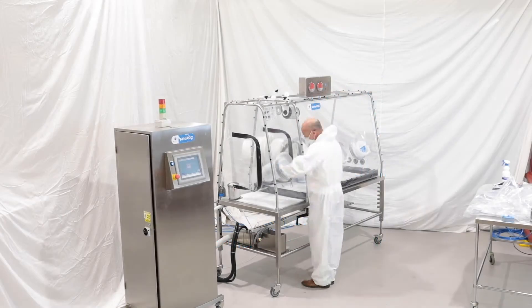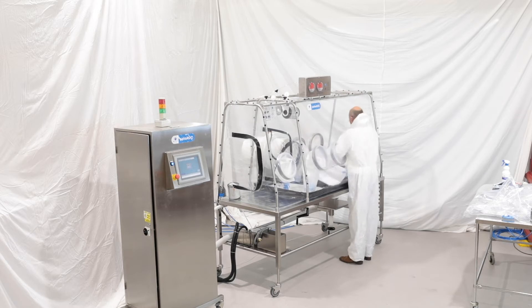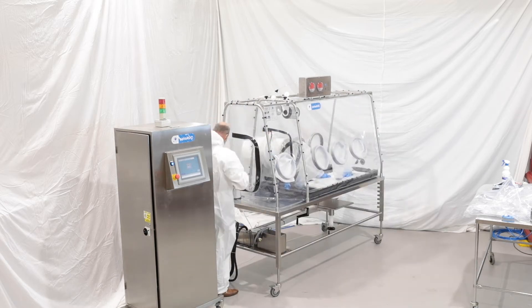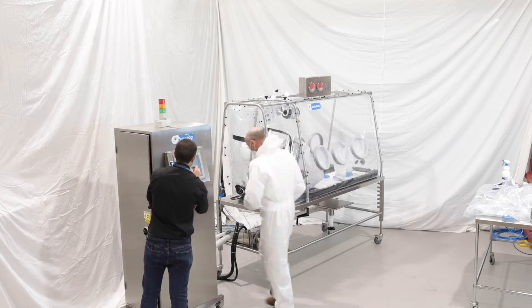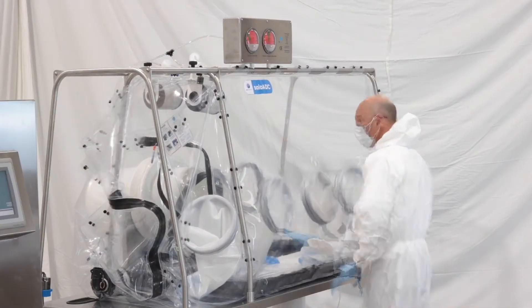Assuming all process equipment has already been removed from the isolator, you start to stack the PVC base plates towards the right hand end of the main processing chamber. You then proceed to untab the enclosure from the stainless steel frame, allowing the air to exhaust from the entry airlock.